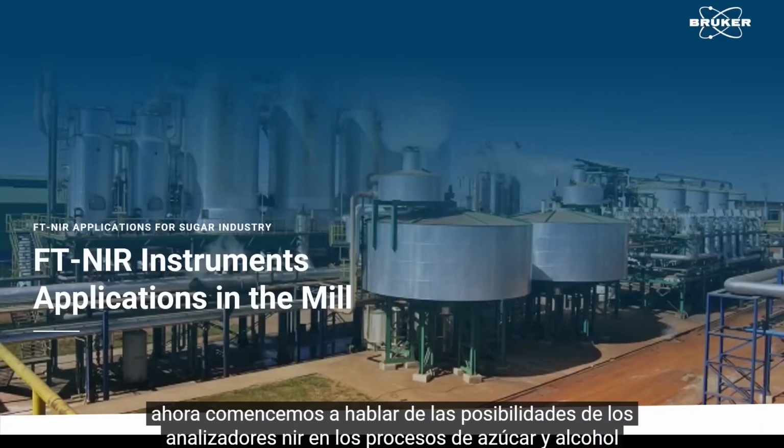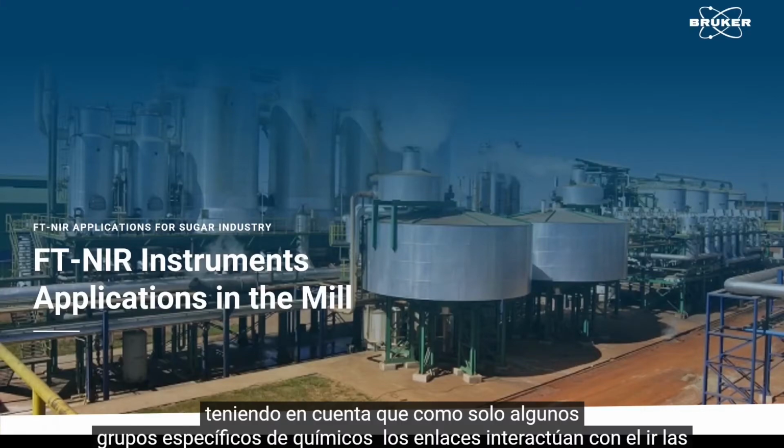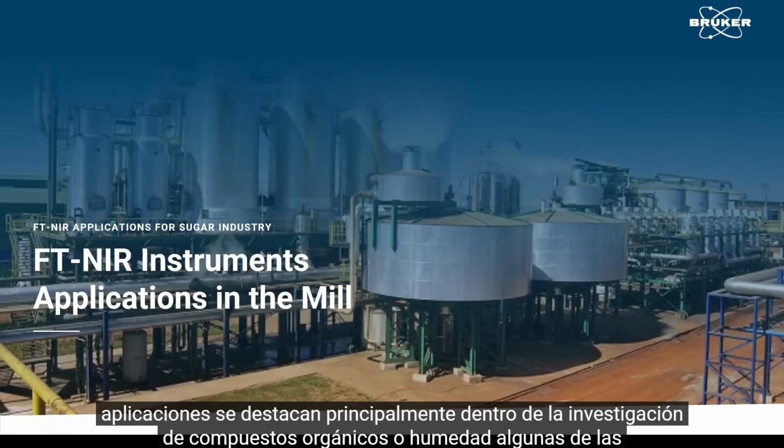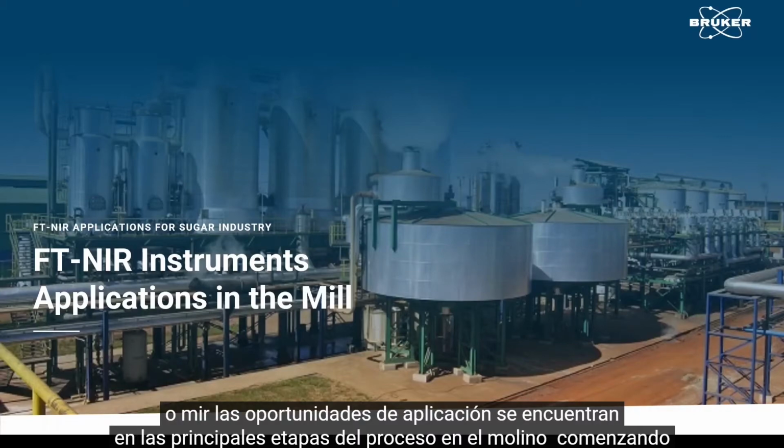Now let's start talking about the possibilities of NIR analyzers in the sugar and alcohol processes. Keeping in mind that only some specific groups of chemical bonds interact with the IR, the applications stand out mainly with the investigation of organic compounds or moisture. Some of the determinations, like inorganic properties or at very low concentrations, cannot be handled by NIR or MIR.